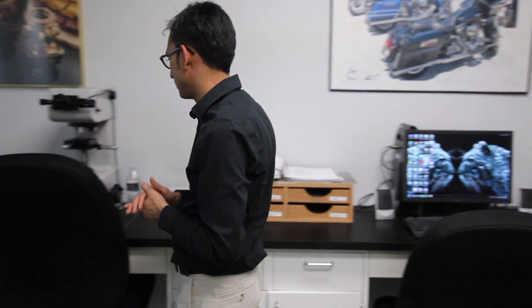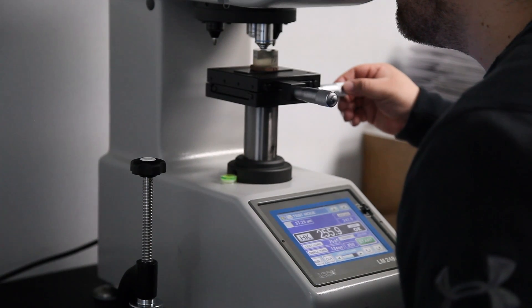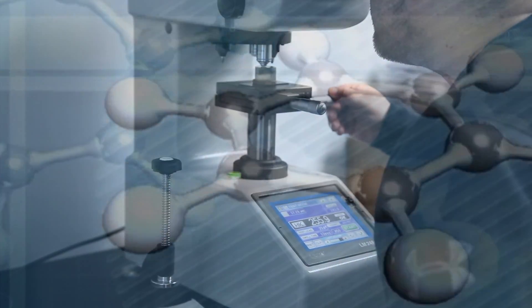The other equipment that you're seeing here is the hardness tester. The hardness tester is utilized to determine the hardness of the semi-bright deposit.